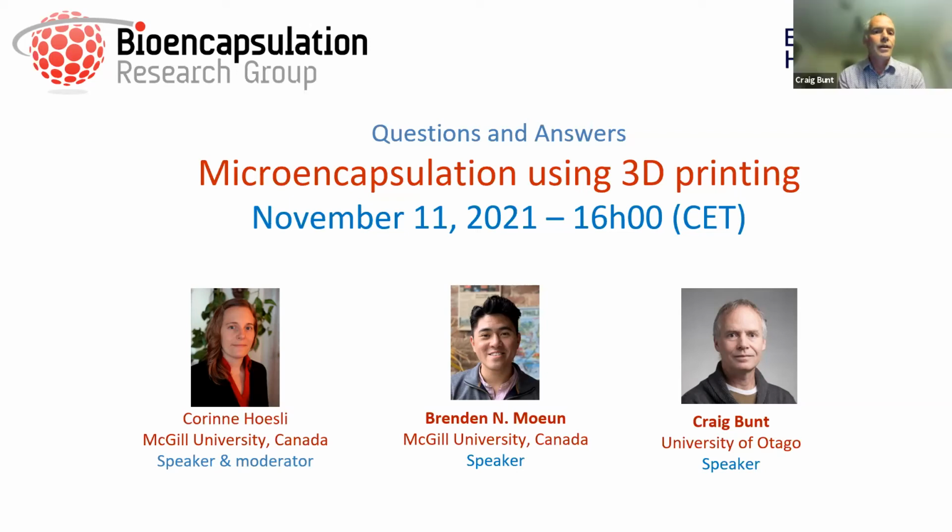If it had been cast, I would have imagined that sort of unit would have taken probably close to a kilo to break for that small size unit. So probably about a third the strength of a molded unit. When you measure that, in which direction do you measure the mechanical properties? Like, is it by compression, or how do you test? Yeah, so for the bullets, it was across the cradle and compression, with the blunt blade.